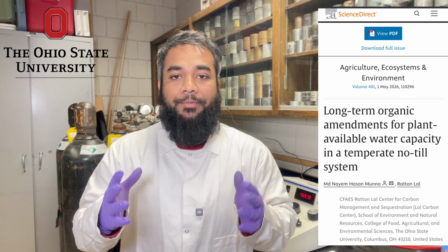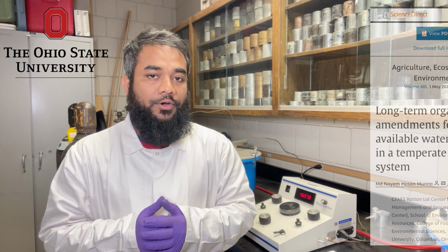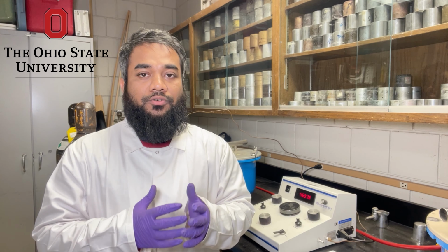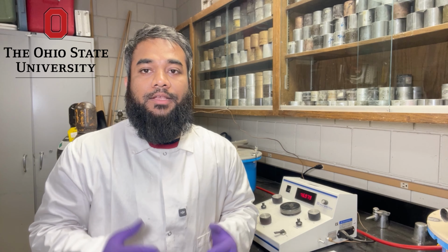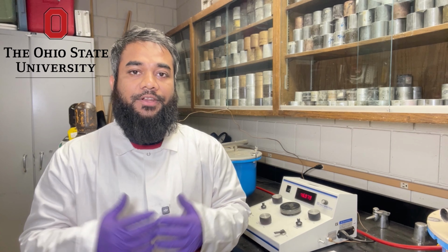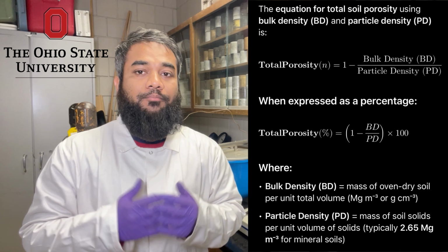Soil porosity represents the fraction of soil volume occupied by pores. These pores control water retention, aeration, root growth, and microbial activity. In soil physics, porosity is not measured directly, it is calculated using bulk density and particle density. You can see here the equation to calculate the porosity.